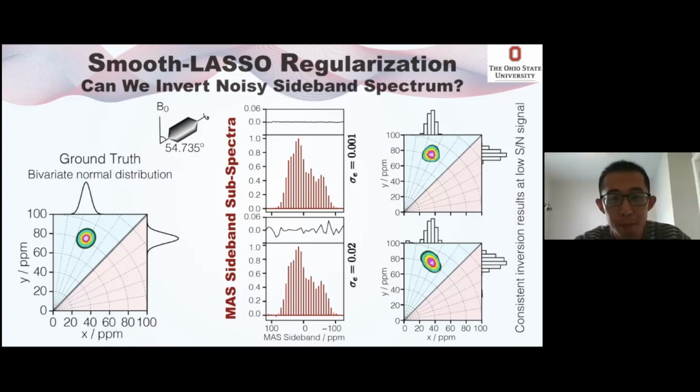Okay, because of time, there are two more remaining questions. I suggest that we finish those two questions, but no more, just for the sake of time. The first remaining question is from Demetrius Sakilarios. Sorry if I mispronounced the name. Very nice presentation. Is there an optimal isotropic and anisotropic 2D experiment that provides the most robust inversion? Does this depend on the sample tensor distribution?